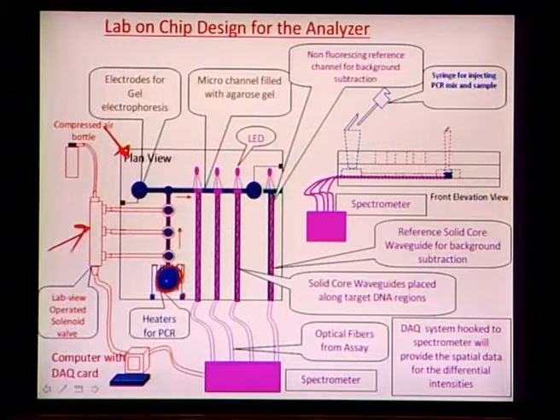There is an inverted thermocouple placed on the top of this chamber, and also there is an RTD, as I will be illustrating later on, which can sense very accurately the surface temperature of this particular chip. Once the PCR fluid with the pure DNA sample is inserted here and rapidly thermally cycled, the amplified DNA is transported using this set of peristaltic micro pumps onto this channel, which has a small pocket carved in this gel filled channel, as you can see, and this is the capillary channel really.